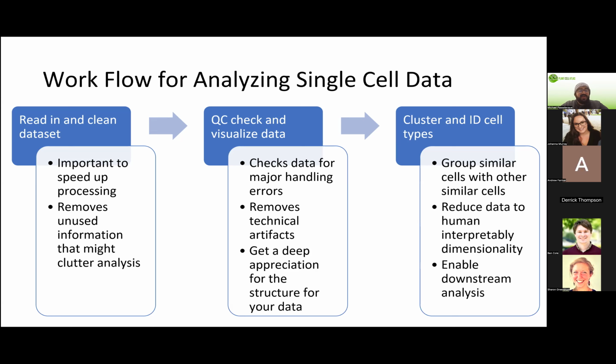Other methods like PIP-seq capture less, and then there's well-based sequencing that does capture more. But really, we do not get a perfect idea of what's in the cell. So it's really good to group these cells so we can reduce sparseness by combining similar cells that might be missing chunks of their expression profile.